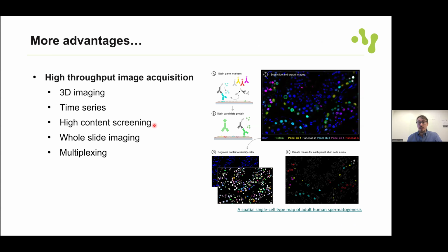In some cases we have 2 or 3 antibodies or reporters that we just place in 3 channels and it's okay. But in many other cases, we need several antibodies to define a specific cell type. And the newer technologies allow us to do several cycles of staining and washing on the same tissue. So we can easily end up with 20 channels.